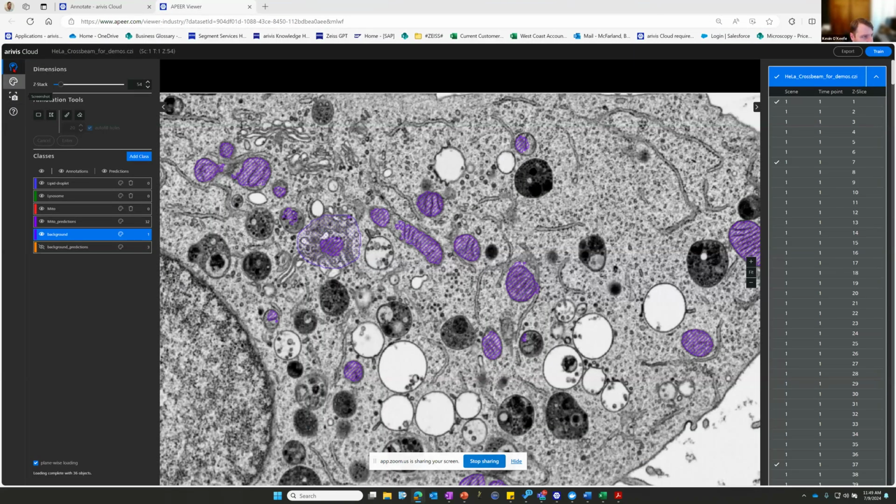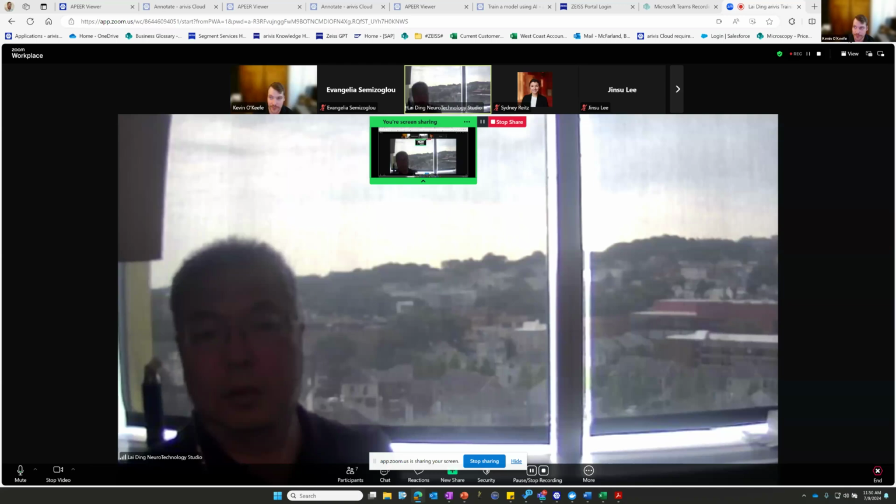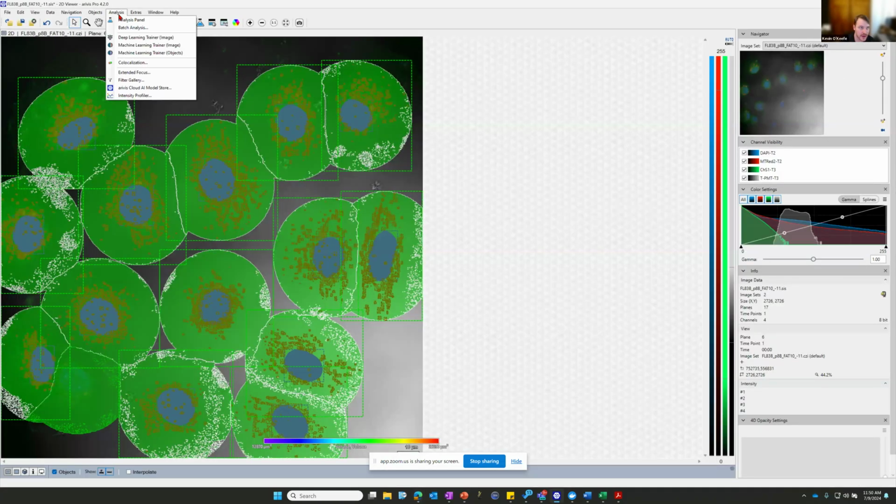All right. So when you log into Arivis Cloud, I'll go to this homepage here. Oh, I guess you don't. And that's actually fine because, sorry, Arivis Cloud is really the same thing as this. Let me go back and share my screen again. The deep learning trainer, which I think you guys do have access to. So that would be this deep learning trainer here. It's kind of the same exact thing. You'll just annotate your objects of interest and see what the result is.